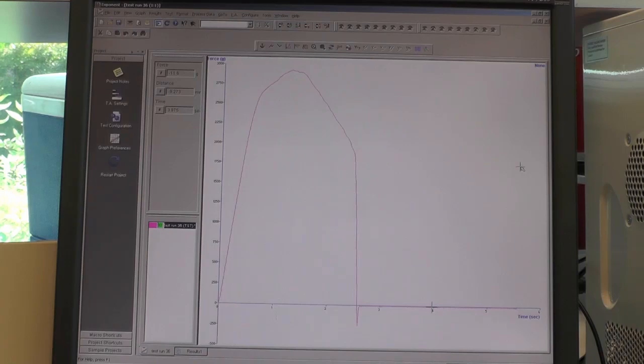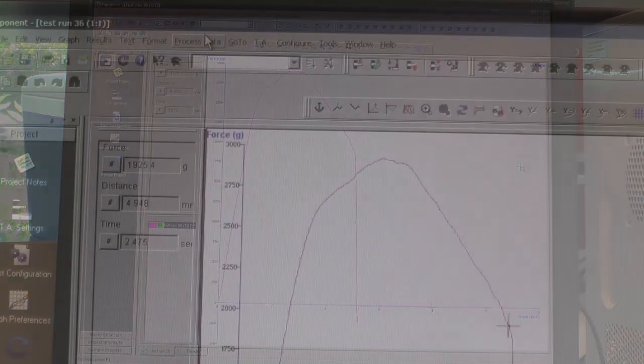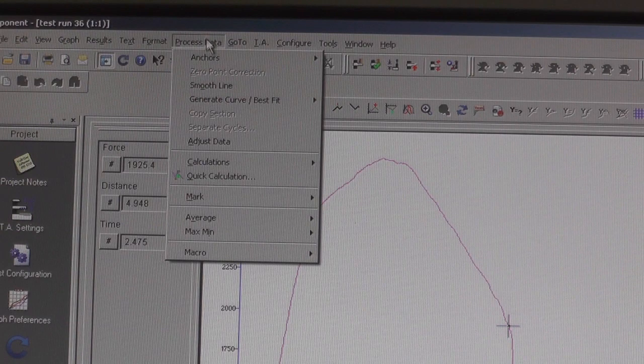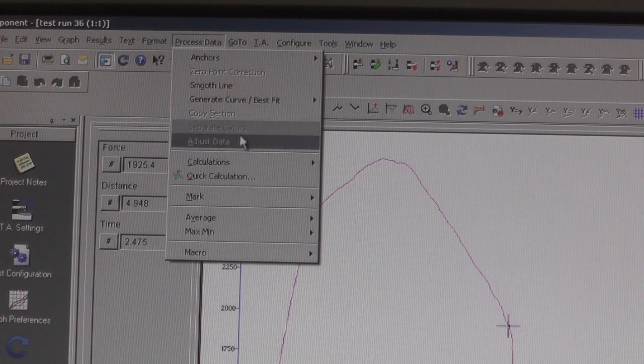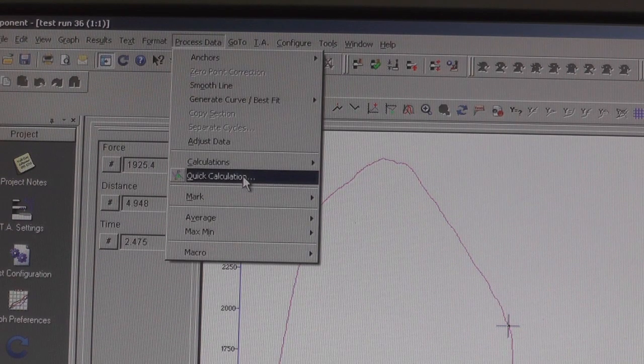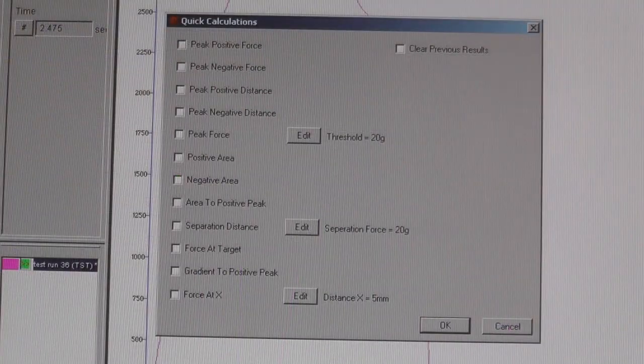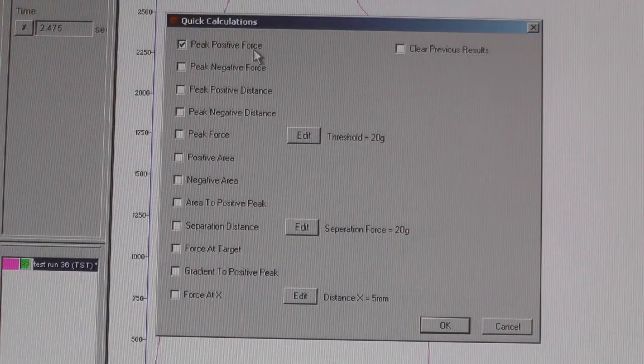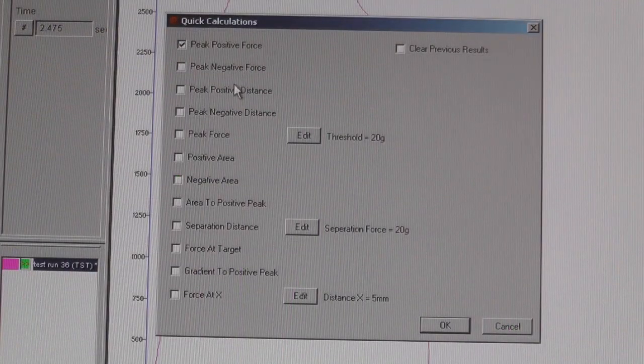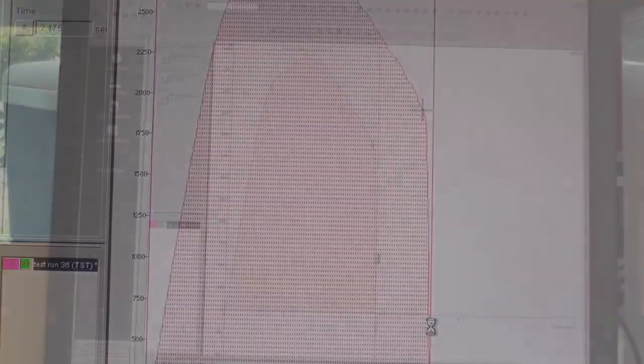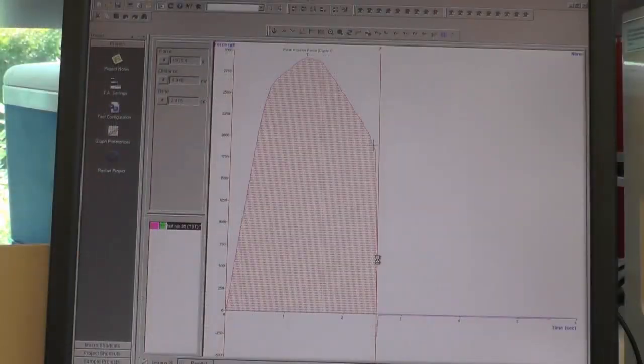After your test is complete, a results graph will appear on the screen. For rapid calculation of your data, go to the Process Data tab and select Quick Calculation. From the list, check off any calculations you want and click OK. The calculated results will automatically appear.